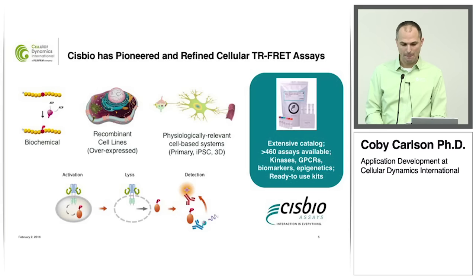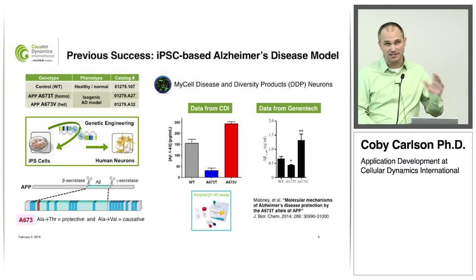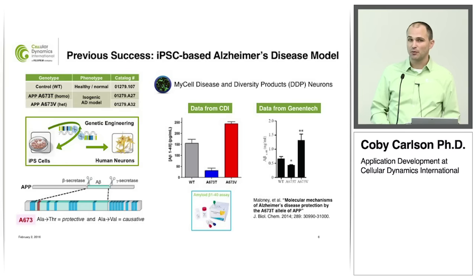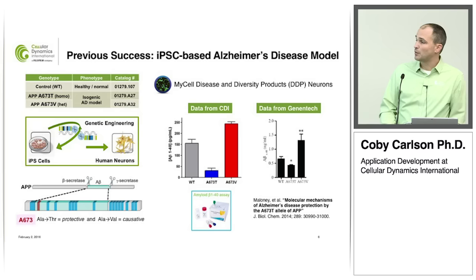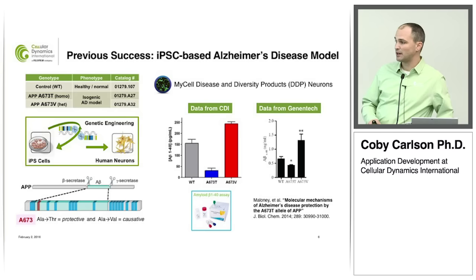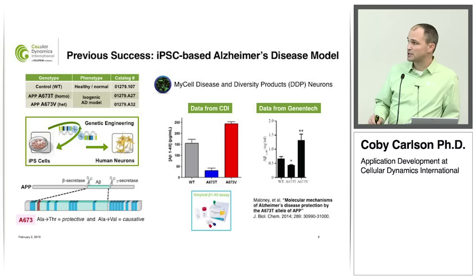So 3 things together, does it work? Well, like I said, we did this last year. We had some previous success showing this, so I'm just putting this together on one slide where here's an example of putting these 3 technologies and companies together to generate, I think, some pretty interesting data. So I'll go over this again. I presented this last year, but what this is showing is an iPSC-derived Alzheimer's model.